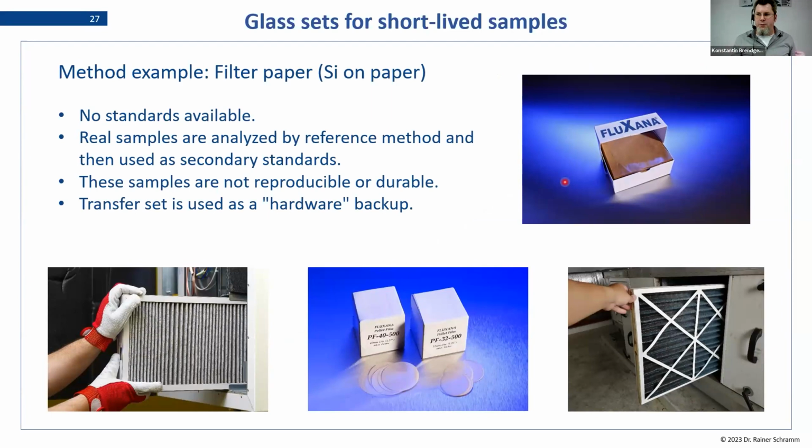Yeah, that's the whole principle. We'll round the whole presentation up with a few examples to give you some ideas where this makes sense. So one of the examples we are using here in FLUXANA laboratory is filter paper. In this case, it's silica on paper.